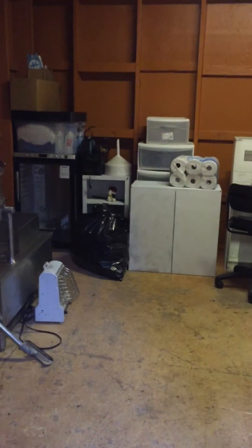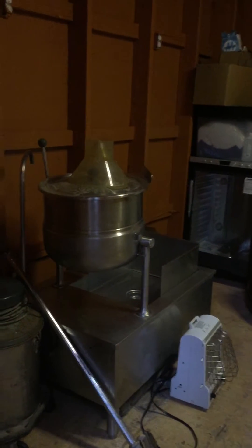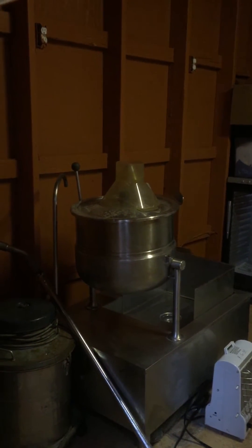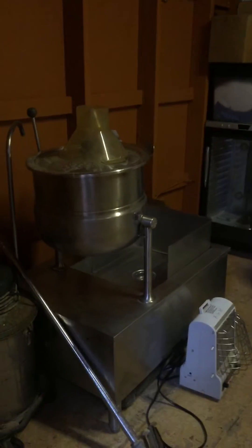Hey everybody, here's a quick shot of our lab we're setting up here. We just painted the inside. I didn't bother putting in insulation — we're gonna redo everything and get into a bigger space, but for right now this works.